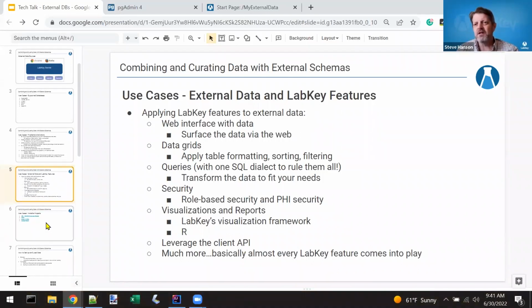And actually, another call out to the devs here. Anything else that's exciting that we should mention here? I needed to stop at some point. Yeah, well, one funny one is, of course, we support JDBC, so you can query your database now, except instead of going directly to the database, you're tunneling through LabKey, which means you can give your users JDBC access for whatever client you might have, but still enforce LabKey security. That's great. Thanks a lot. It's a great point. Wonderful.